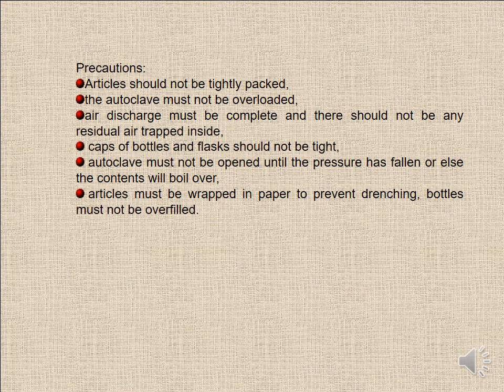There are certain precautions to take when sterilizing with an autoclave. The articles should not be tightly packed. The autoclave must not be overloaded. Air discharge must be complete, and there should not be any residual air trapped inside. Caps of bottles and flasks should not be tightened.